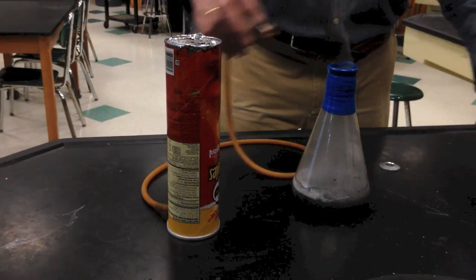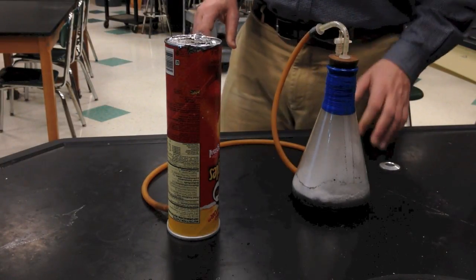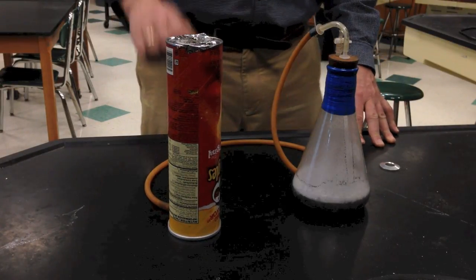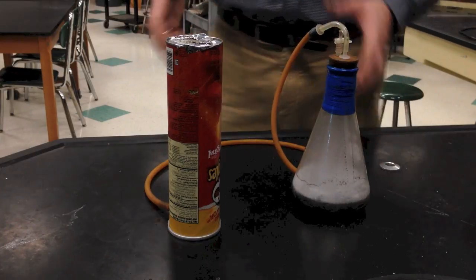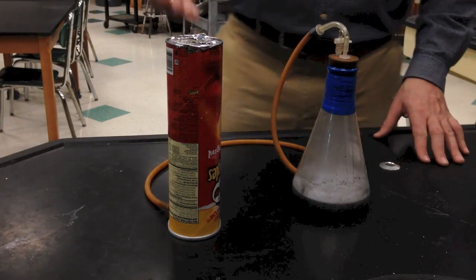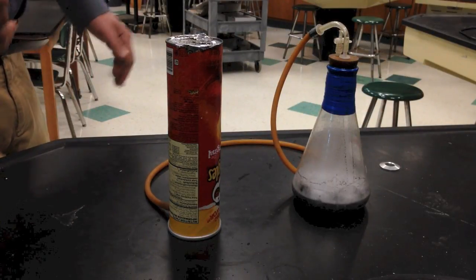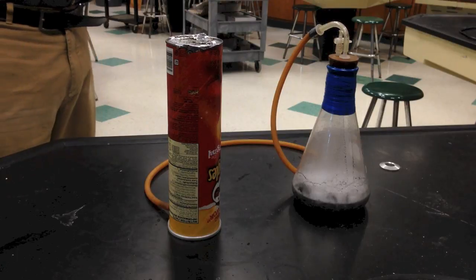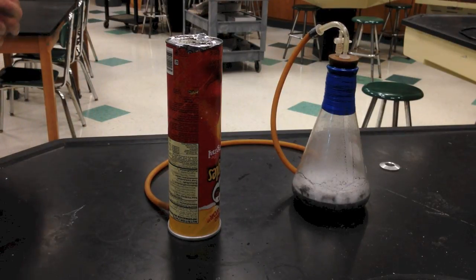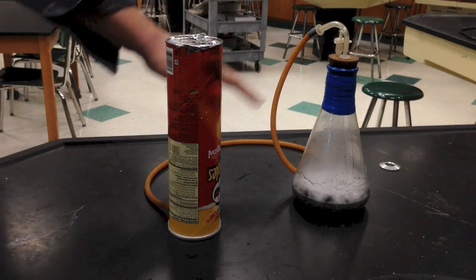and now I'm going to connect the stopper, which is now connected to my Pringles can. And the Pringles can, of course, has the hydrogen coming in at the top. Okay, so same thing, I'm going to flush all of this Pringles can, all the volume of air in here, all the oxygen and all the air out. So I have 100%, or at least approximately 100% hydrogen. If you look carefully, I'm not sure if you can see this from the camera, but you see some of the same condensation occurring here that's coming through.